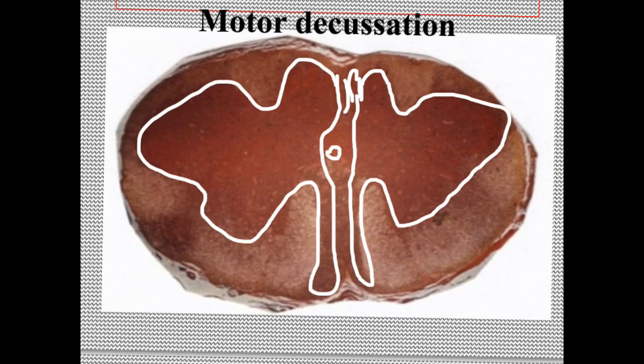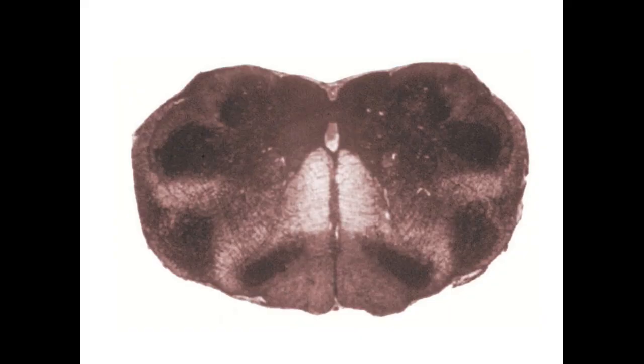Actually, what we have here, we have the direct pyramidal tracts after decussation has taken place, and here we have the gracile, cuneate, spinal trigeminal, all you know in the drawings of the CNS. So when you see a central canal but the H shape is not present, this is a closed medulla. Look for the shape of the gray matter. If it looks like a butterfly or two birds, it is the motor decussation.